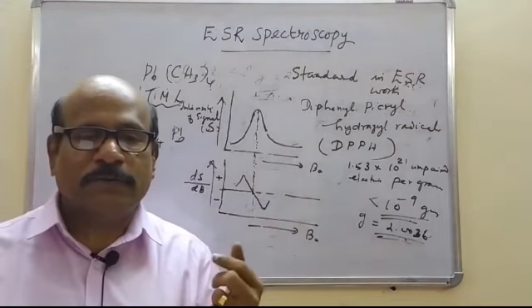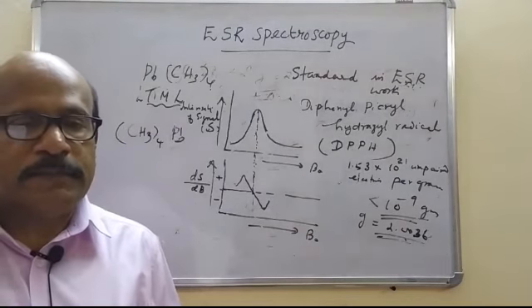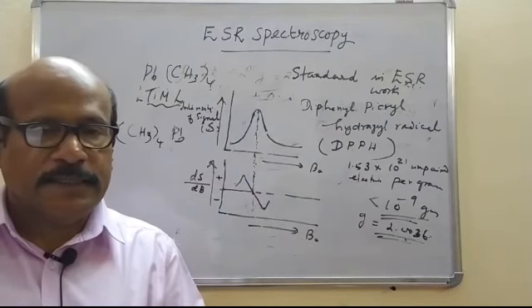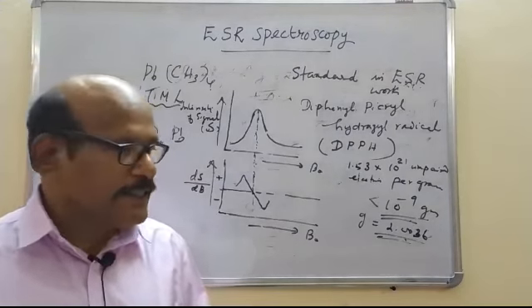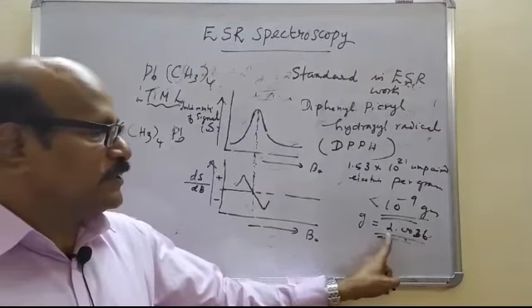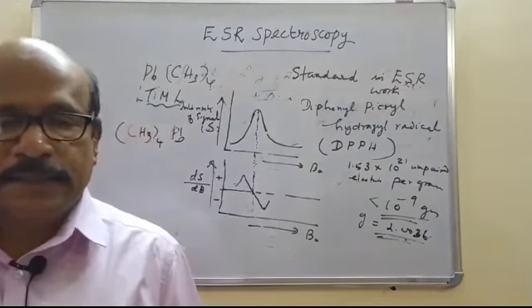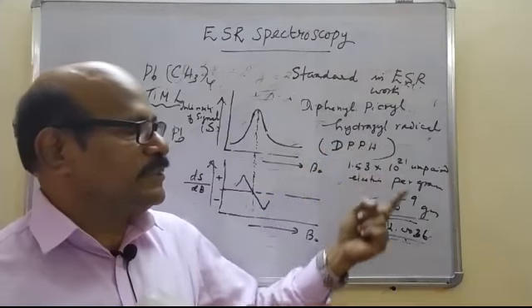That is a technique that you have. In order to avoid the overlapping signal, the unknown sample and DPPH signals are taken separately in a given recorder. The G value of most radicals is very close to this value, so the sample is not exposed simultaneously with the DPPH.